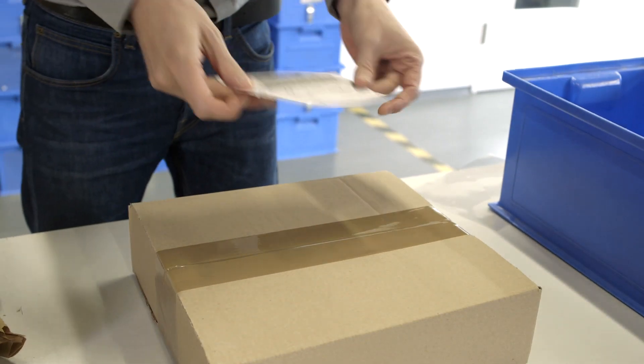Now your pipette is professionally serviced, safely packed, and ready for shipment.